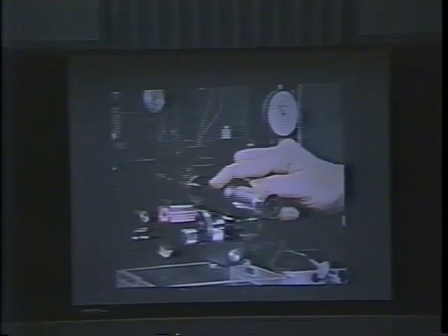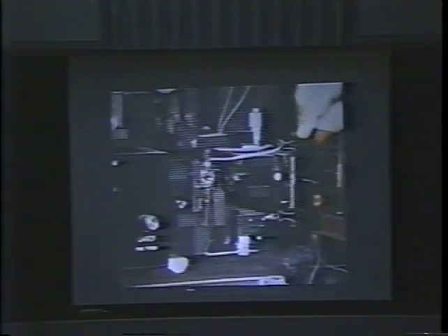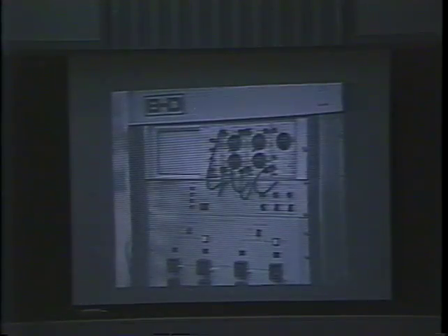Part of the initial success of the instrument was due to its open design, which made it accessible and versatile. And conceptually, it was a tool that could be modified. It could be modified by us. It could be modified by the customers, because many of the customers were leading-edge scientists. They had their own engineers. They had their own electronic people. We left lots of room to expand, because the vision here was that we couldn't predict where this was going to go, what it would need next year, and we had to be flexible.